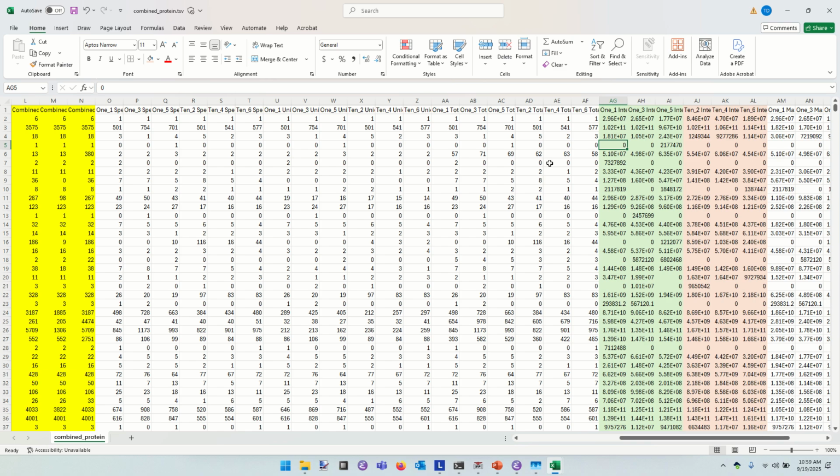I just pulled a bit of sleight of hand on you, and I think it's worth talking about. This is an intensity reported for a protein. Did the mass spec measure proteins? No. The mass spec measured peptides. So it has peptide intensities, and that peptide intensity information has been combined to produce a protein intensity measurement. So it's always worth your while to poke into that a little bit and understand how peptide intensities become protein intensities.